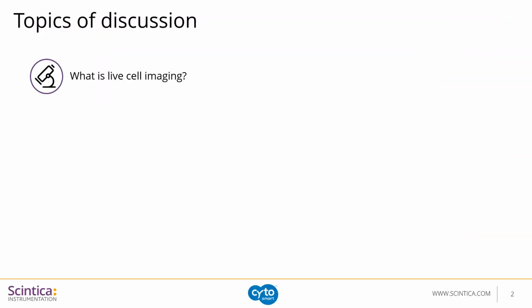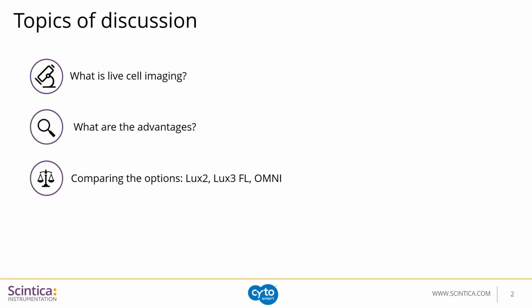In terms of outlining today's topics, I want to start with a brief introduction to live cell imaging, what it is and why you would want to add it to your lab's capabilities. We'll talk about the advantages of live cell imaging compared to some more conventional methods. I'll then go into each system individually, starting with the Lux2, the Lux3 FL, and finally the Omni system, highlighting the system specifications, showing some example images, and then finally discussing some potential applications for each system.